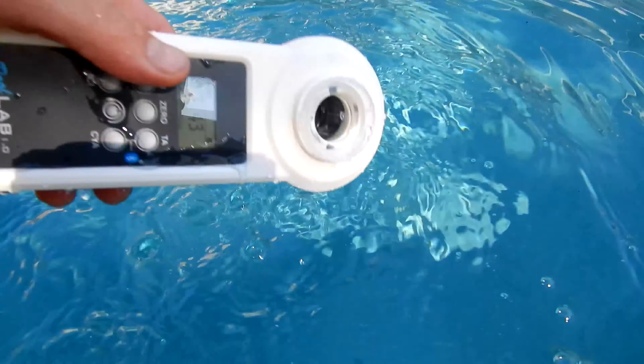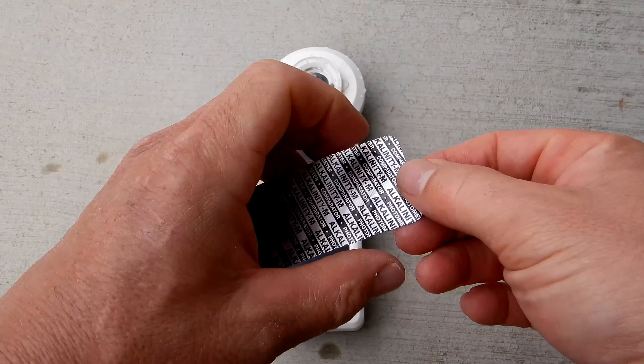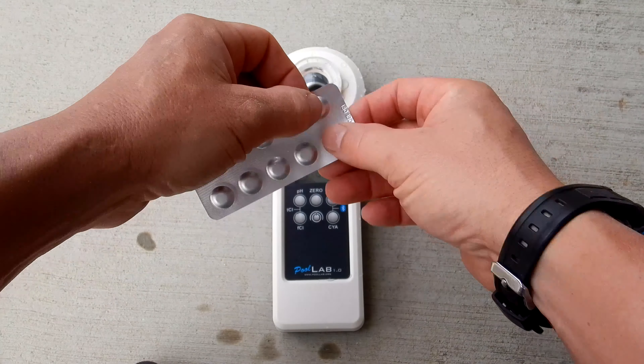We're going to clean it out and get another sample for the alkalinity. If you're running a series of tests, you don't have to zero it out every time — just when you initially start it up.